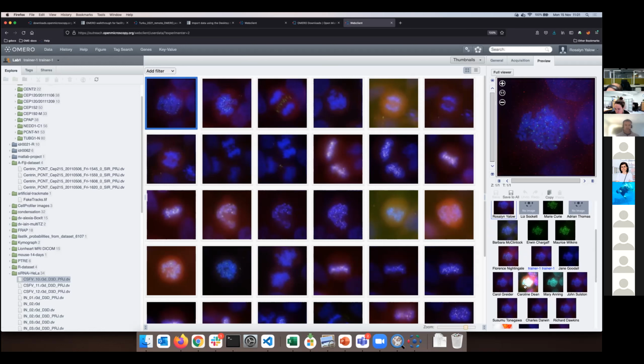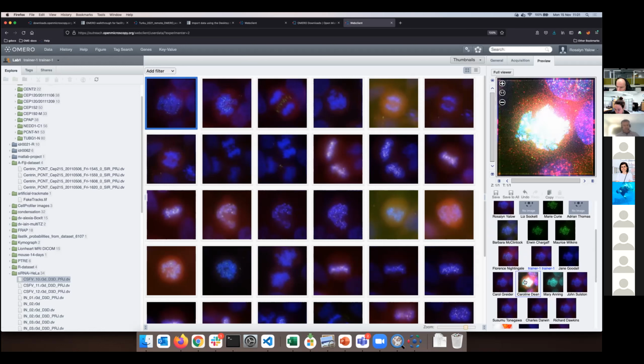Caroline Dean and apply them. I can again say save to all. So you can see that each of the users has their own rendering settings, but because they are viewing somebody else's images, it's the rendering settings pertaining to that image. You also have your own images in your own portfolios. They are similar, but not the same. This is a quirk of the training server.